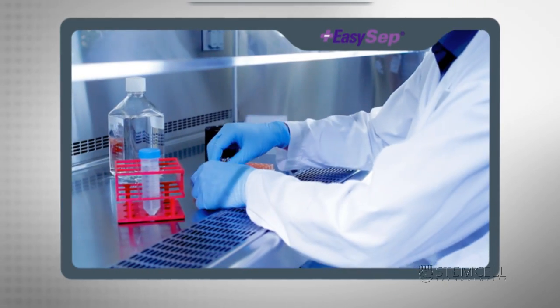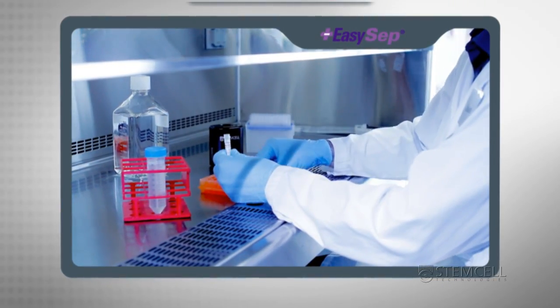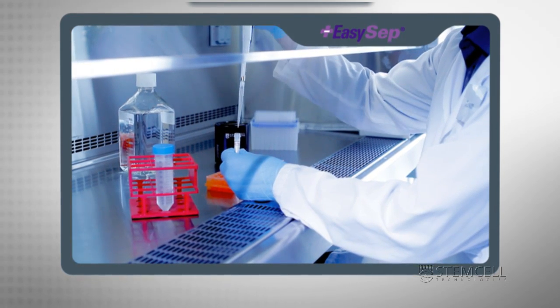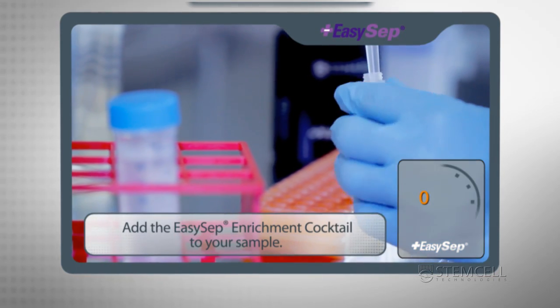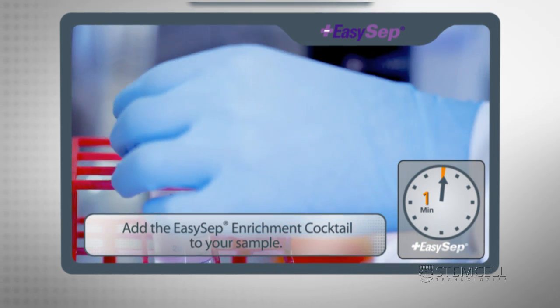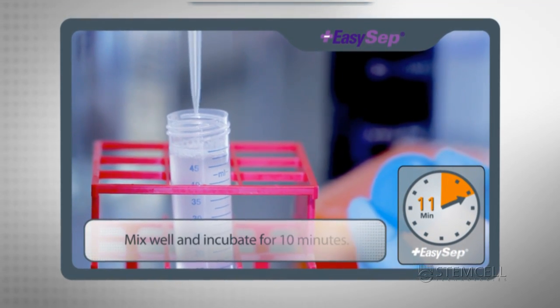To isolate human cells with EZ50, start by preparing your nucleated cell suspension in a 50 milliliter conical tube. First, add the EZ-Set Enrichment Cocktail to your sample and incubate for 10 minutes.